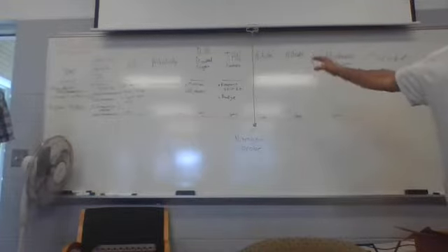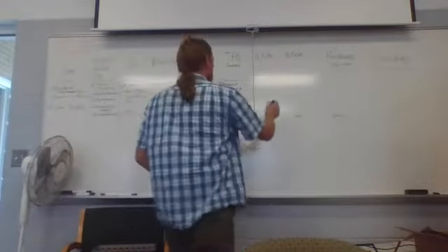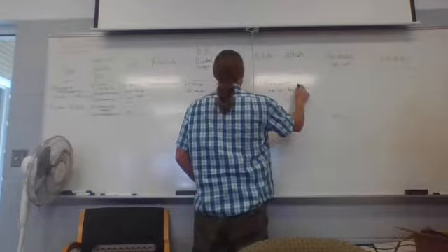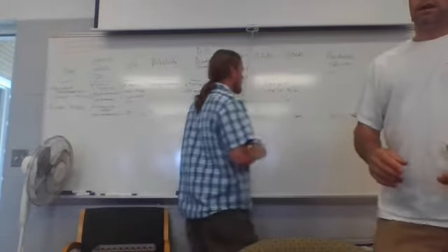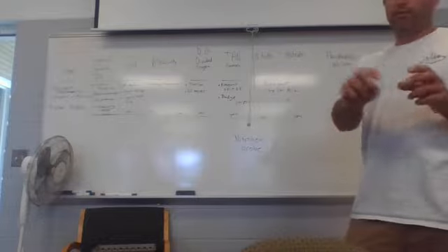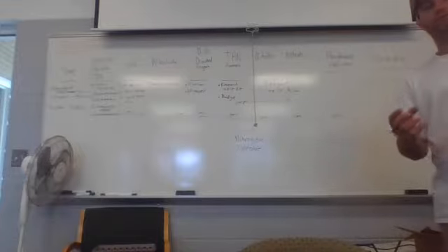All right, nitrite and nitrate, we can do those together because they basically have the same types of tests. Strips, liquid tests, spectrophotometer, strip. And so with the reagent, sometimes there's a liquid reagent, and sometimes it's a powdered reagent, depending on the manufacturer and the test. And the different manufacturers that use the colorimeters, LaMotte has these little tiny spoons that measure out a certain amount that you add, and Hach uses these little packets, powder pillows they call them. You cut them open and pour each one out, and it's really about which one works best for you. It's still kind of doing the same thing, giving you that color change, but they can be different. They can be the same chemical reagent, but in different forms.